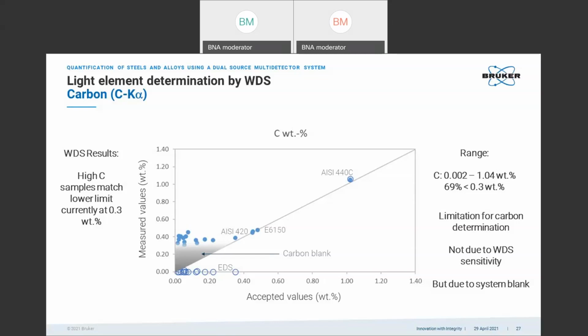Clean the interior very thoroughly and use the plasma cleaner steadily, and also use an air jet to blow away the carbon on the analysis spot and freeze out the carbon with the help of a cooling finger. This is what we will do at some time in the future. Then we will present better data showing that WDS can in principle go much lower, to very low carbon contents. The limitation here is just the contamination of the system.